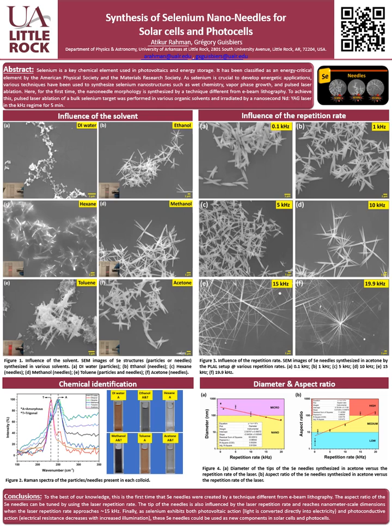And also, you can see from the inset of those SEM images, this is the Tyndall effect of the nanoparticles or nanoneedles. When we shine the laser beam in the colloidal solution, you can see the scattering of the laser beam, and we can say yes, we have nanoparticles inside the colloidal solution.